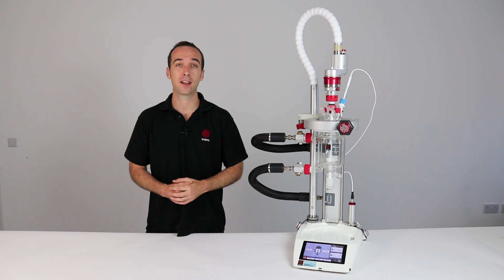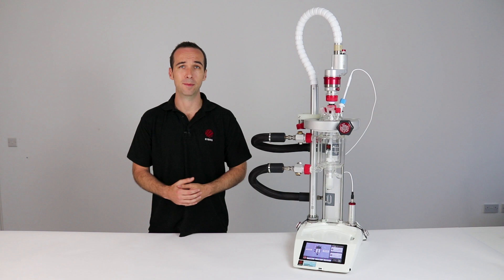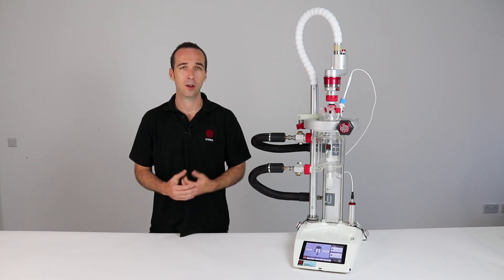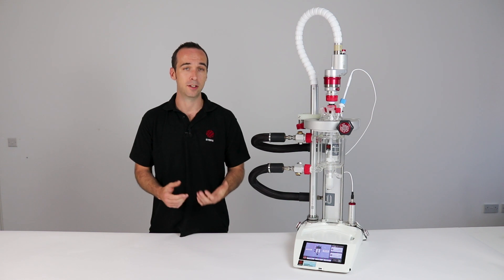Hi, I'm Stephen from Syrris, and today I'm going to be talking to you about the Atlas HD. The Atlas HD system has recently received a major update to reaction automation, and through consultations with our customers, we listened, developed, and implemented a number of new features such as pH control and sensor-based dosing, and clear and simple experimental visualization.